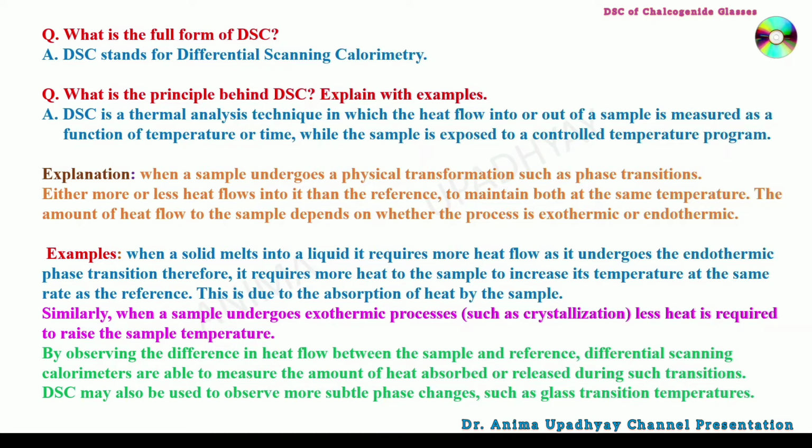DSC is a thermal analysis technique in which the heat flows into or out of a sample and is measured as a function of temperature or time while the sample is exposed to a controlled temperature program. The explanation is simple. When a sample undergoes a physical transformation, such as phase transitions from solid to liquid, either more or less heat flows into it than the reference to maintain both reference and sample at the same temperature. The amount of heat flows to the sample depends on whether the process is exothermic or endothermic.